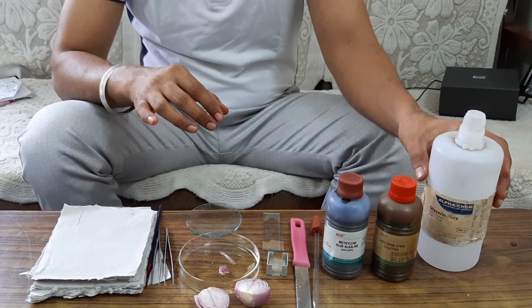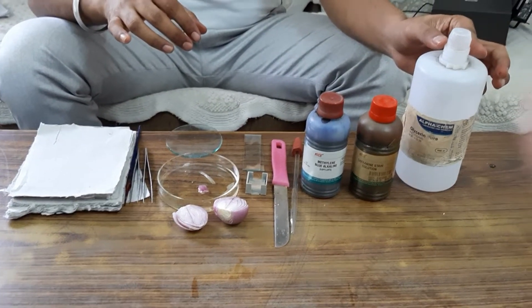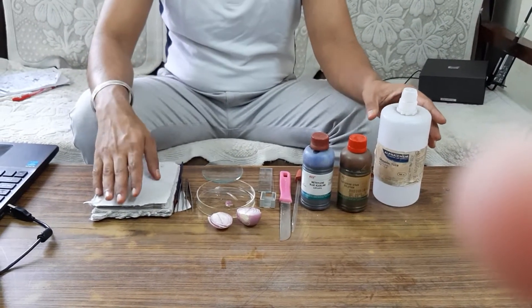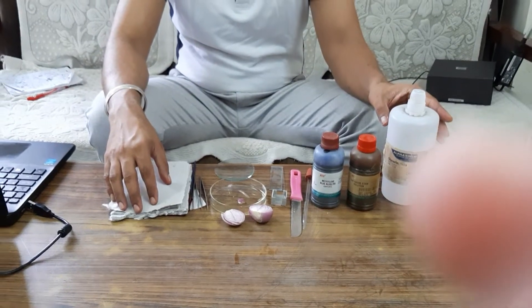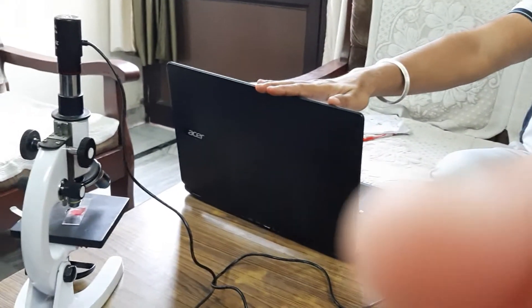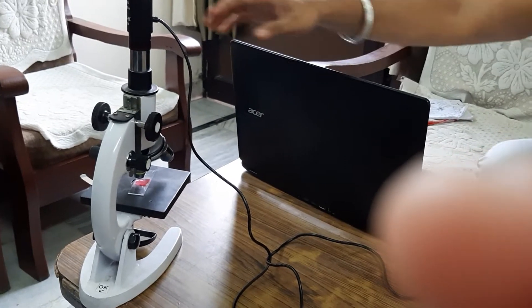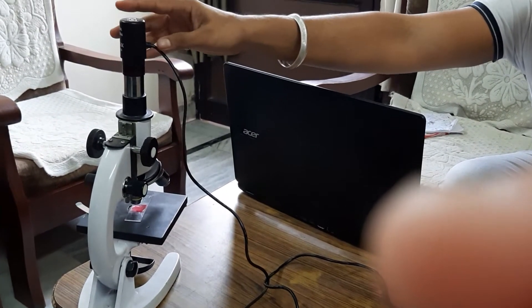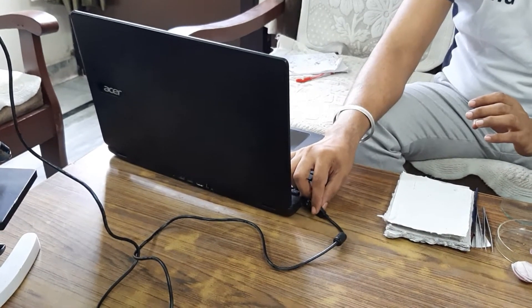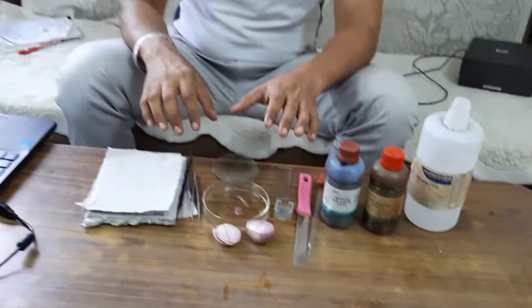We have glycerin to prevent the drying of the material. We also need filter papers to remove excess stain. Here I have a microscope to observe the onion peel — I have fitted a camera on it which is connected to my laptop, so later I will show you the slide on my laptop.